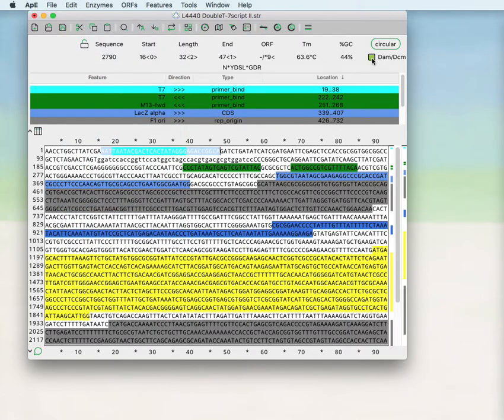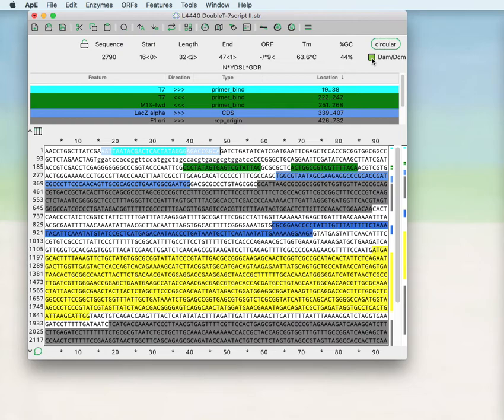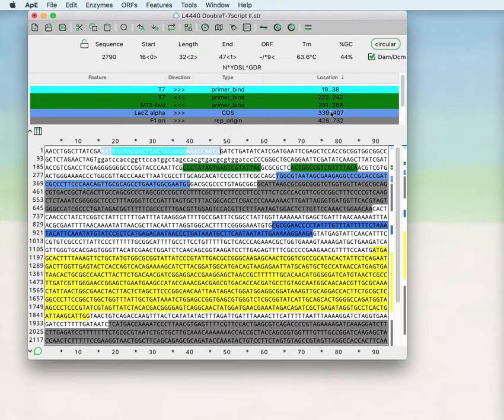You can change whether the sequence is treated as methylated or non-methylated. If the DNA is coming from an E. coli source, most times that will be methylated unless you have a special genotype, so you'll generally click that. Whereas if the DNA has been from a PCR source, you'll want to turn that off and that will affect how restriction enzyme sites are found.